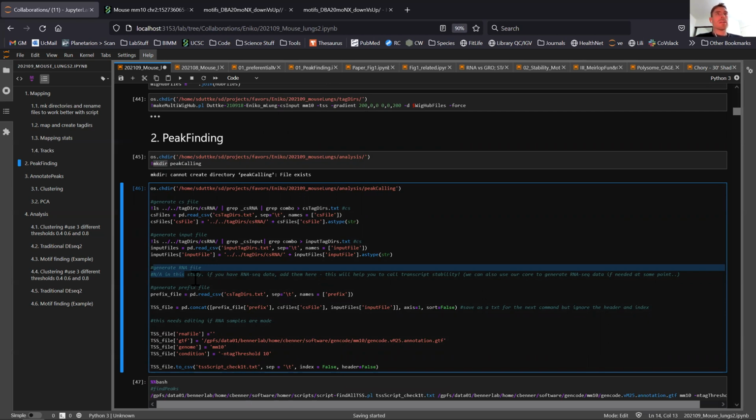So this script is a nice little tool to look at stable versus unstable RNA, which I'm a bigger fan of than using promoter proximal versus distal, as these annotations were made on cell type X, but you study cell type Y, and start sites commonly change between different cell types.